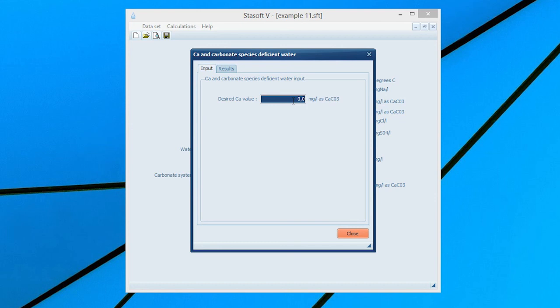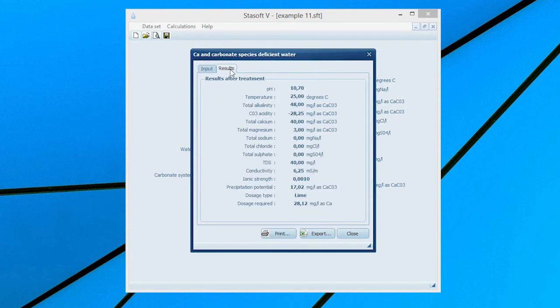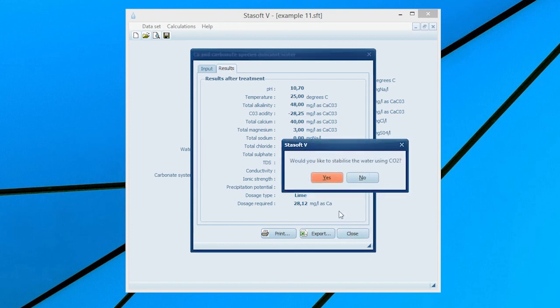Enter the required calcium concentration of 40 mg as calcium carbonate by typing 40 into the desired calcium value input box. Selection of the Results menu option will bring the Results After Treatment window onto the screen with values of the state of the water after lime dosage and the dosage of lime required to increase the calcium value to the desired concentration. Selecting the Close option will bring the Stabilize Enquiry window onto the screen, allowing the user to recarbonate the water with carbon dioxide.